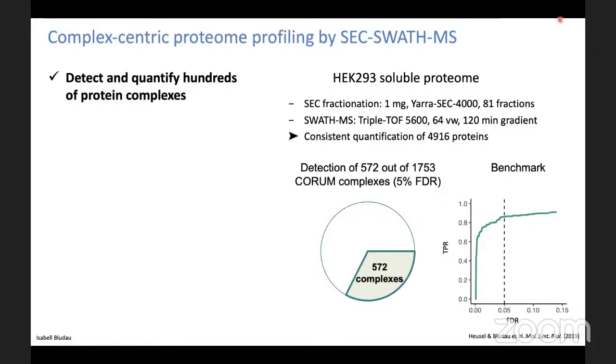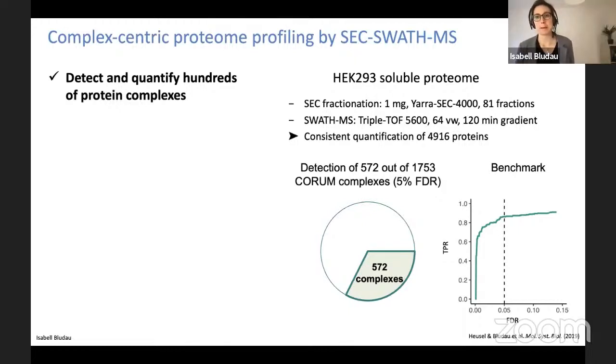Hi, yes, sorry. The question came to mind when you were talking about the filtering, that you're checking if, let's say, a peptide was present in consecutive fractions or not. But how would you actually classify if the signal is in there? Do you use an intensity threshold for deciding if the area that was integrated is from an actual signal or is just noise being integrated? And if that's the case, how would you define what's the appropriate threshold to use? I'm not sure if I explained myself very well.